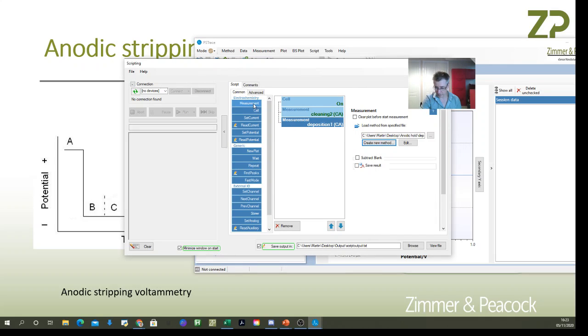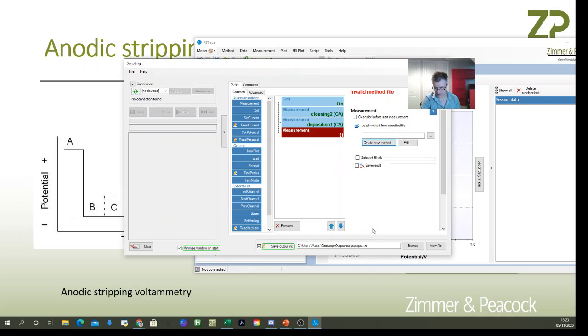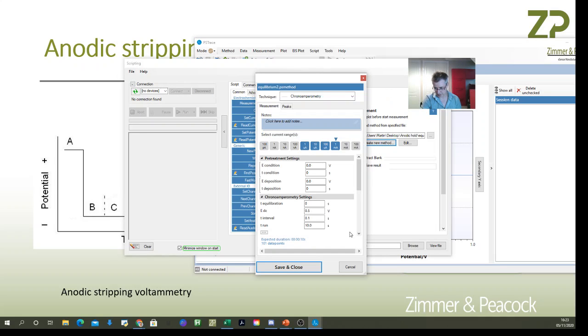Now I add the equilibrium step, calling it 'equilibrium'. I'll keep conditions similar — minus 1.5 volts, save rate of one per second, for 60 seconds.